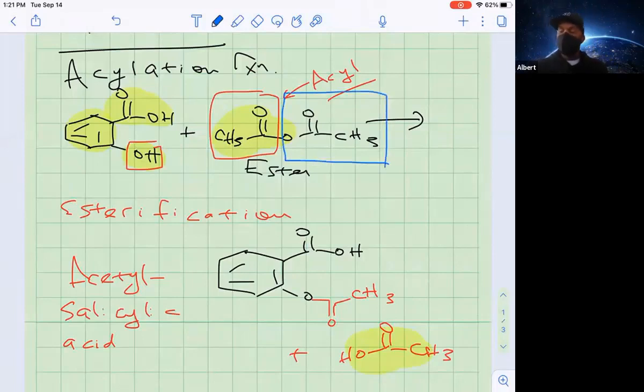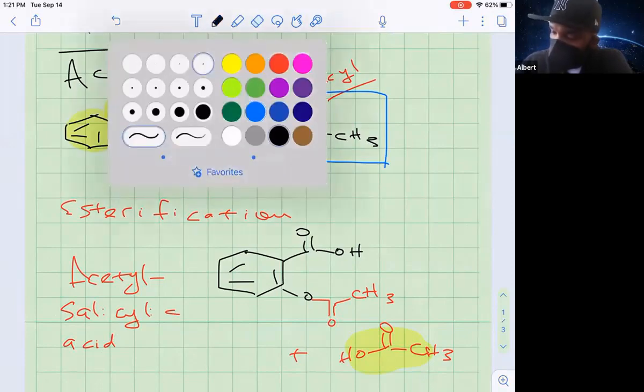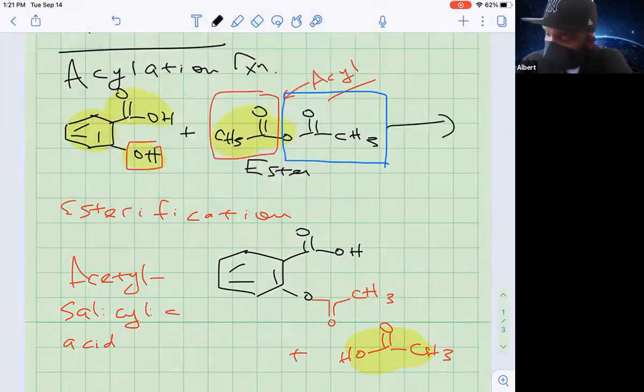All right. So we're doing the reaction in the presence of sulfuric acid, H2SO4. Deadly stuff, but we're only using a catalytic amount. And we're heating this up, so we're going to use a water bath.